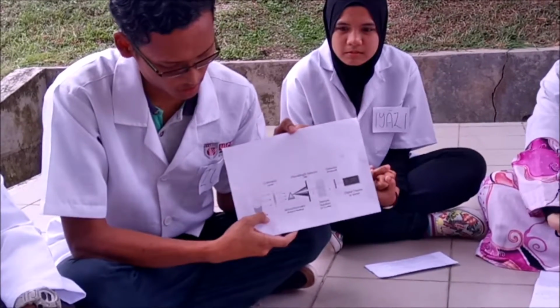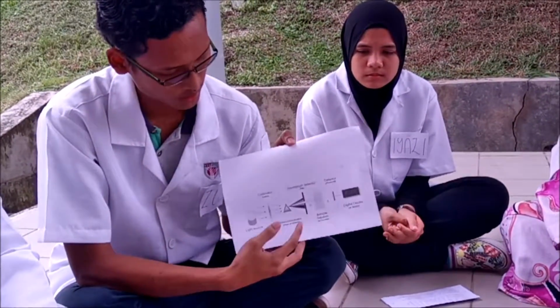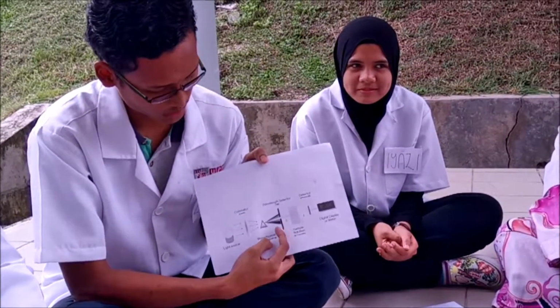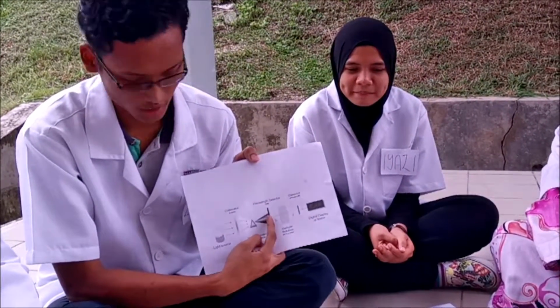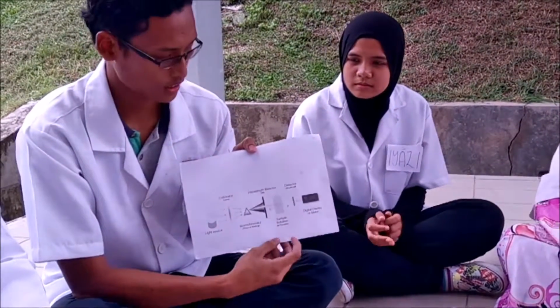Here we have the light source, and then to the collimator, and then to the monochromator, passing through a wavelength selector which has a little slit, and then through the sample solution in the cuvette, and lastly it will go to the detector, which will detect the light and display it in quantity form.